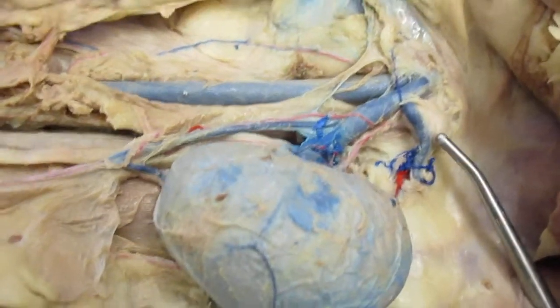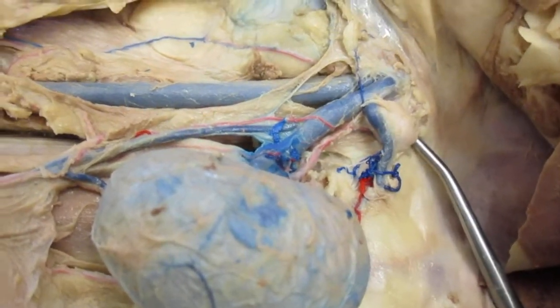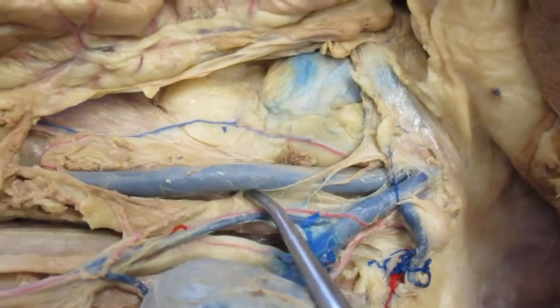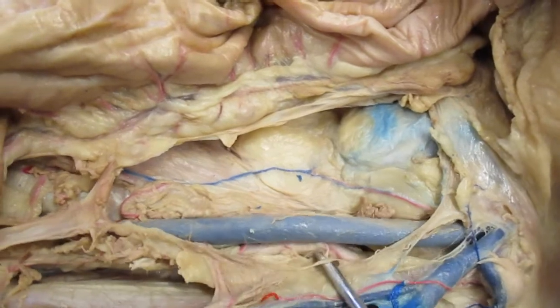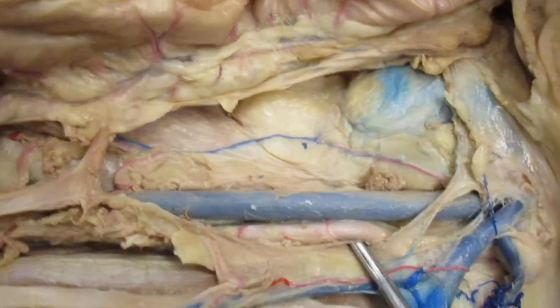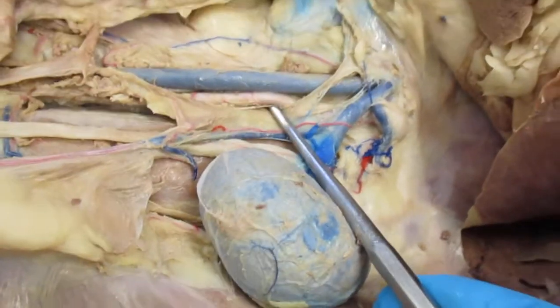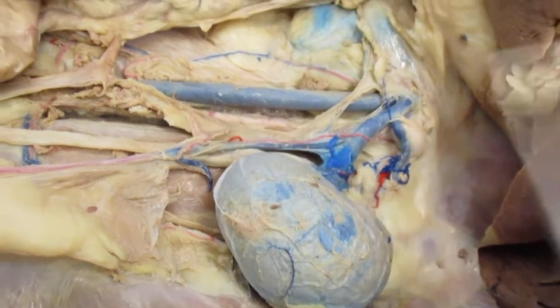Hopefully you can. This is the adrenal gland. This is the adrenal gland of the cat. Adrenal gland. This is the inferior vena cava, right here. And then this right here is your abdominal aorta. So abdominal aorta and inferior vena cava. So we can see everything I just showed you right here. Okay.